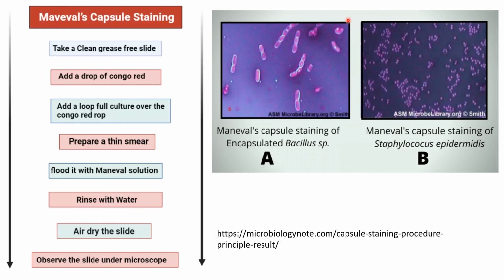Okay, and another advantage of this technique is that it stains around the cell, so therefore again we limit cell shrinking. So therefore, it's better to measure cell size also by negative staining. Okay. So another thing about this kind of staining, remember the principle. The capsule is non-ionic, so it's not reactive to the stain. That's why it appears colorless. Okay.